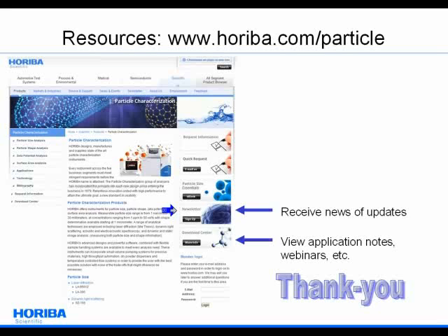So if you can come up with a value for the real component, let's say that's fixed at 1.6, there's a software tool in the software which will show you the results using imaginary values of like 0, 0.01, 0.1, 1, and 10. And it will pick out that best refractive index value for you by minimizing an error calculation. So what we generally say is literature or Google searches will usually point you towards a good value for the real component of refractive index, and use a Method Expert wizard to come up with the best choice of the imaginary value. But for a very full, complete answer to this question, visit the website and check out the webinar on how to select refractive index.